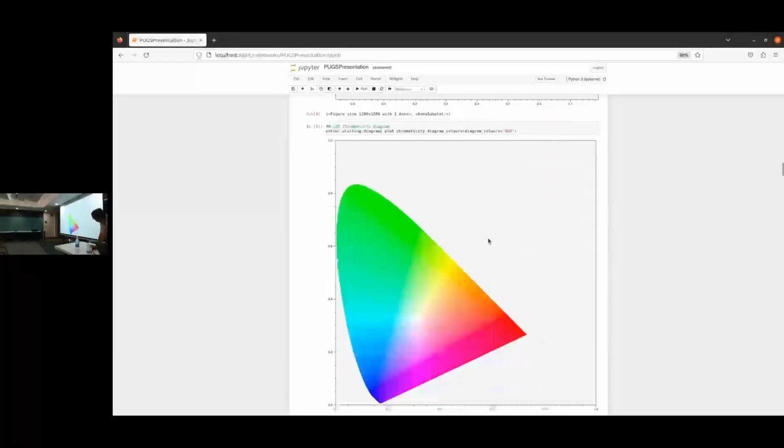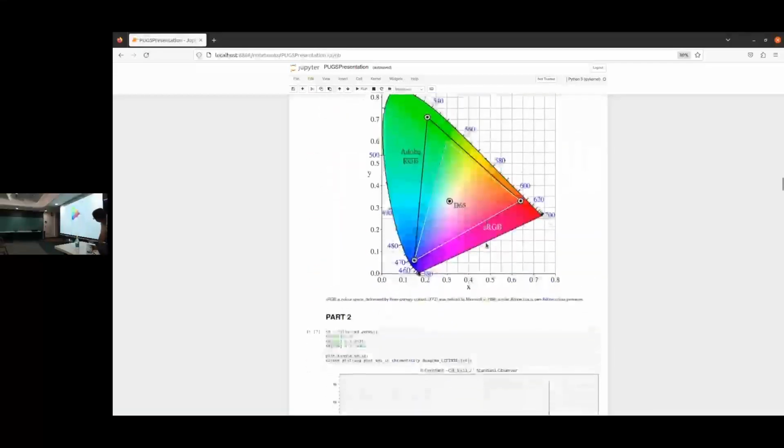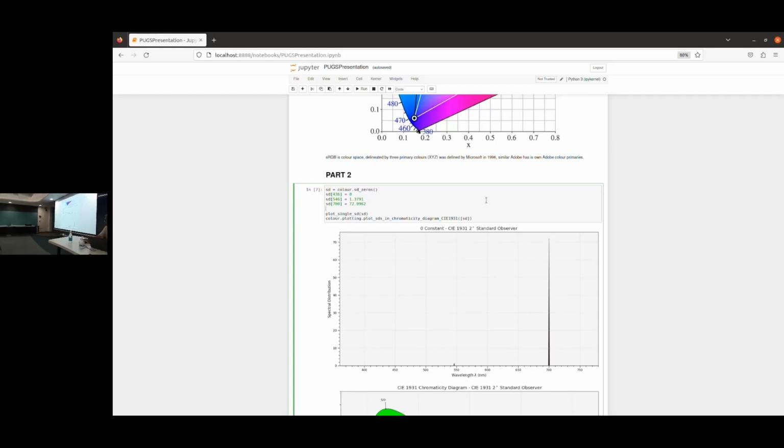So next thing I want to look at is this color science package, and we have the ability to explore some of these ideas in color science using this data structure. Here it's called the spectral distribution.